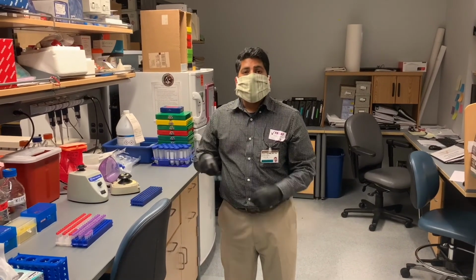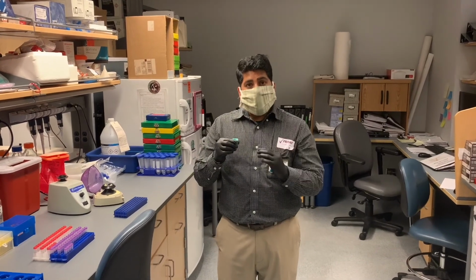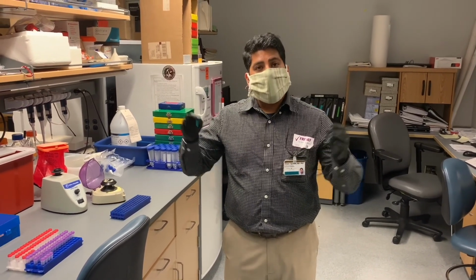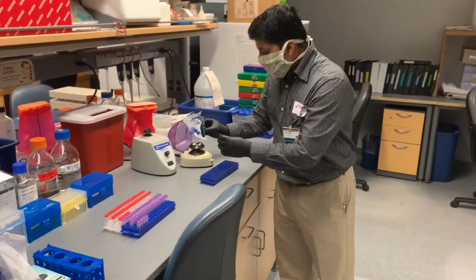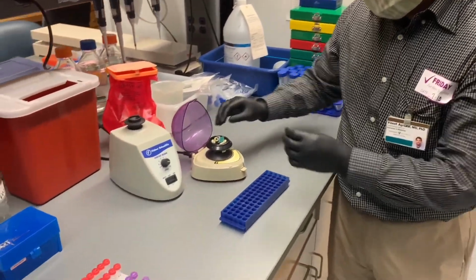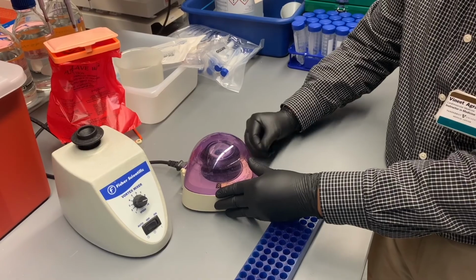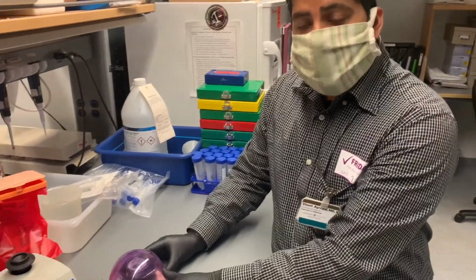Other ways that we can mix samples, or if we need to bring samples to the bottom of a tube so we can remove them, is through a centrifuge. We have various types of centrifuges in the lab, anywhere from large to small, but I wanted to show you the smallest one that we use here. What we can do is we can take tubes, put them in, shut the lid, and what it'll do is it'll spin everything down to the bottom of the tube.